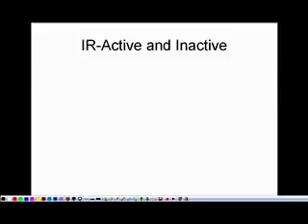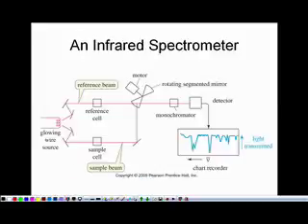The way we make this measurement is using what's called an infrared spectrometer. Basically, we need a source of infrared radiation. That turns out to be a glowing wire. If you've ever seen an infrared heating lamp used to keep reptiles hot, that's a place you would see it. Sometimes in hotels, they put an infrared lamp above the shower so that when you step out, you feel this warmth, which is the infrared light coming down. At fast food places, they use infrared lamps to keep the food hot. So you just need an infrared source. Then you pass the infrared source through the sample, and sometimes through a reference as well. Then it goes to what's called a monochromator, so we can select what particular wavelength we want to pass through the sample. Then it goes to the detector, and we create a chart.